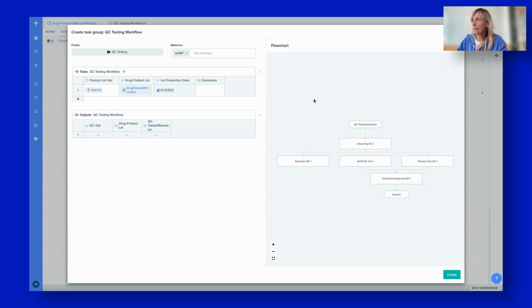You can see here the new flowchart builder functionality in Benchling. In most cases, the steps the team is going to follow might be locked, reviewed, and approved, and this will support very well those teams that need defined processes. However, this flowchart builder also supports teams that need more flexibility, and need the flexibility of changing this process as we are asking the team to process this request.